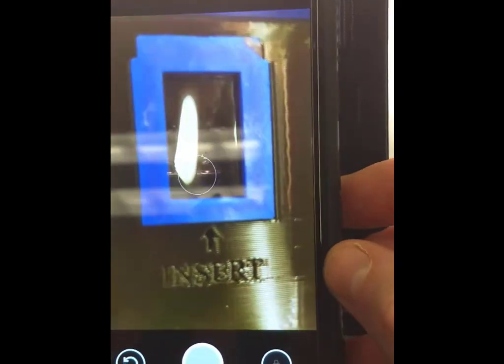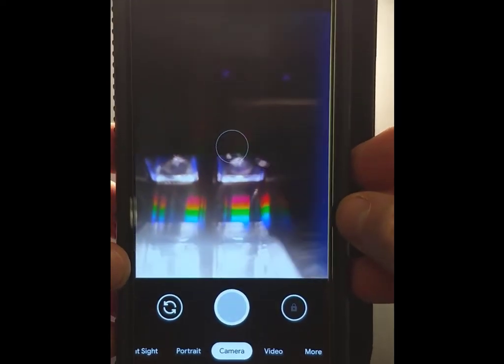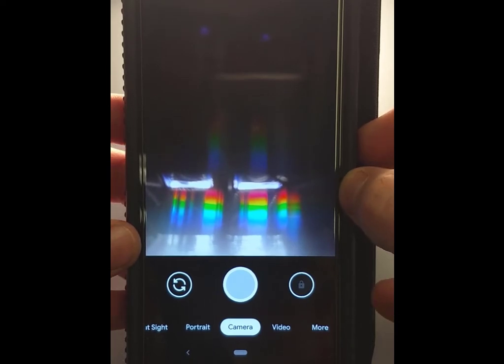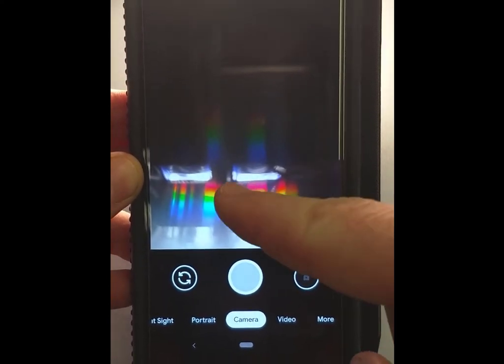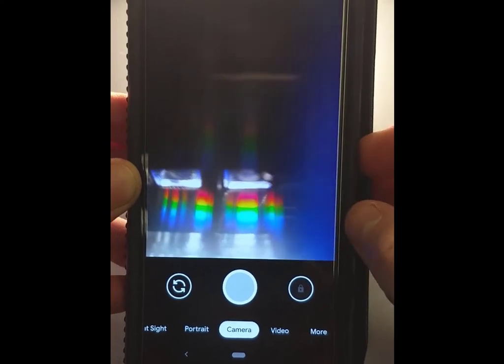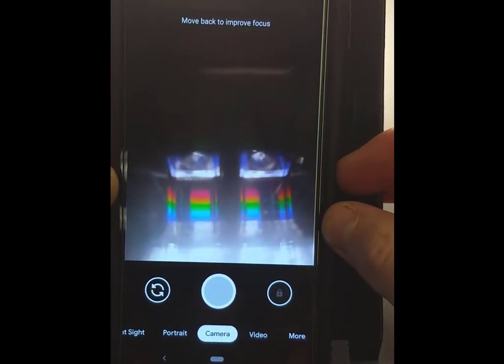Take your phone in camera mode and lower it onto the base. You can start to see actual rainbows — those are the diffraction patterns of the white light. What you're looking for in alignment is two distinct bands. You may actually see four — that's fine; the two outer ones are the left and right cuvettes and the others are reflections. Moving in any direction causes you to start losing the spectrum.